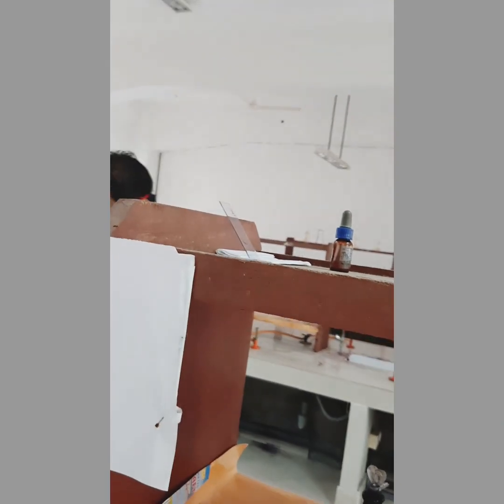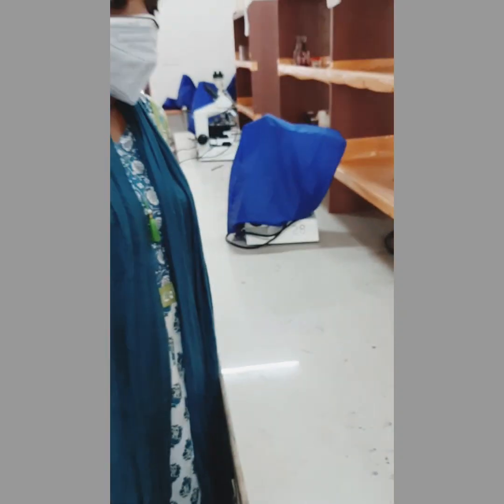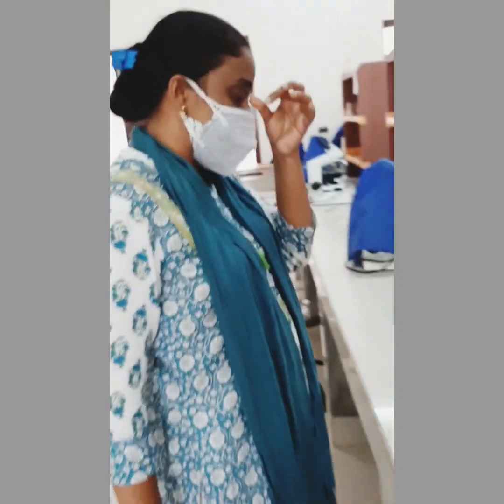So next we can learn about what is acid fastness. This acid fast property is mainly shown by Mycobacterium species. This is due to the presence of mycolic acid in the cell wall. Mycolic acid, as you have studied in your theory, is a wax-like substance present in the cell wall of Mycobacterium species.